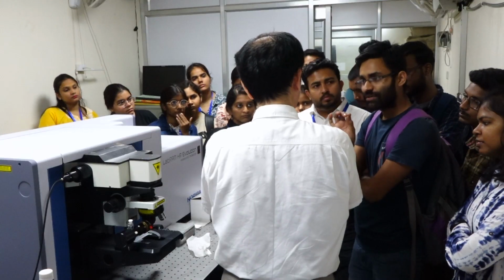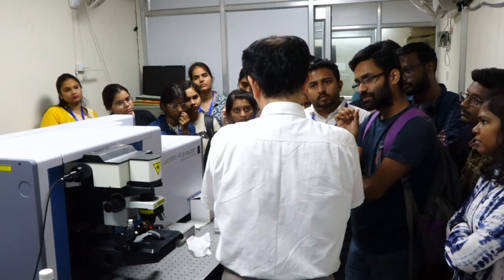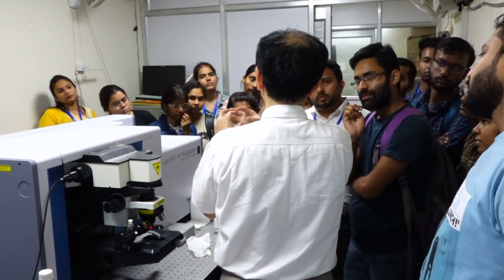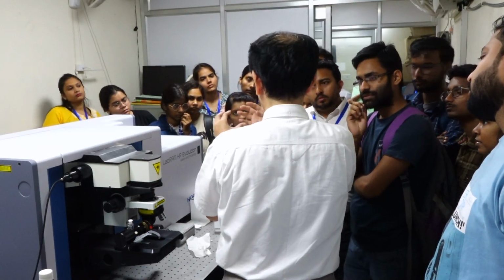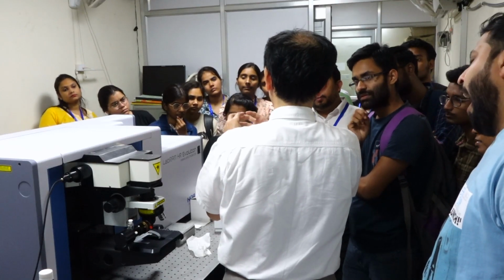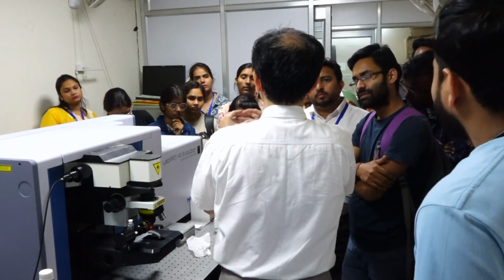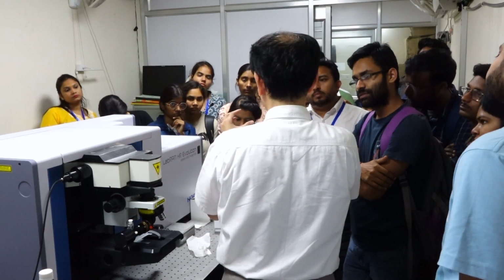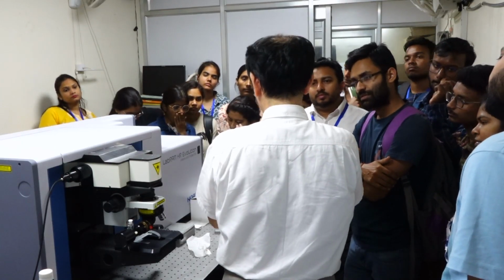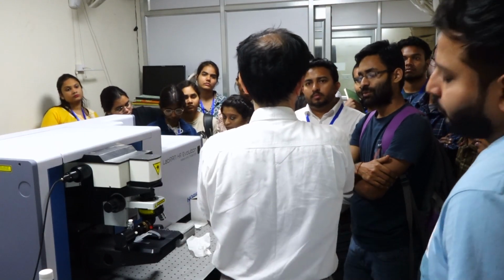So can we take the spectra of gaseous molecules? By preparing some container, glassware, and filling the gas. But the density of the gas molecule is very low. So typically they prepare a container for high pressure, increase the pressure and measure the Raman spectrum. By doing so, we can increase the density of the gas molecules, and the Raman scattering signal becomes larger.